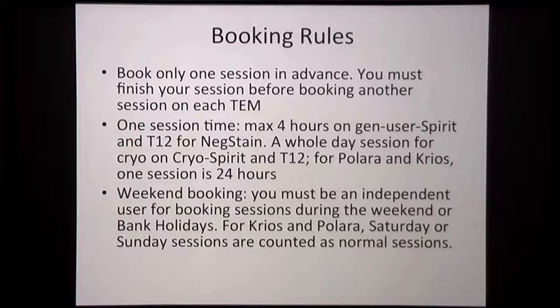And at night time, we can use EPU to do the automatic collection for single particle or your tomography batch. The batch program from FEI or SerialEM can also do it now. You can set up something for overnight, or maybe some people like to just stay there, watch it, and stay overnight. We also often see students just sit there, having a shift every 4 hours. So this is the cryos.